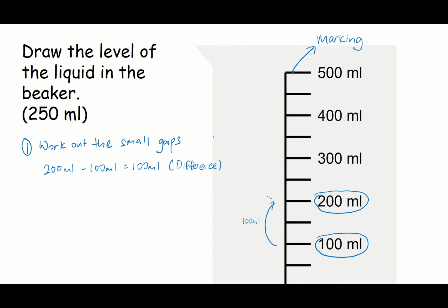You will find that it is the same throughout because that's the way your beakers are designed. Then now the question is, how many steps make up 100 ml? You're right, the answer is 2. 2 steps. If there are 2 steps and each step is the same, we can call them 2 units.